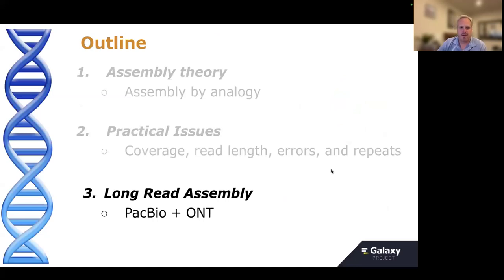Okay, so we've talked about the basic principles. We're going to build up graphs. We talked about how, when you do sequencing, you need to oversample substantially. You can use tools like GenomeScope to assess your data to make sure it's high quality. And then we talked about how, given high quality and high coverage data, we can go through and build up our assembly, and then likely need other scaffolding information to assemble the complete chromosomes.